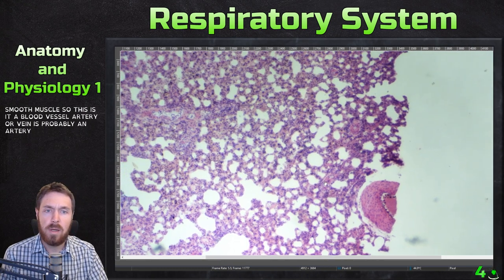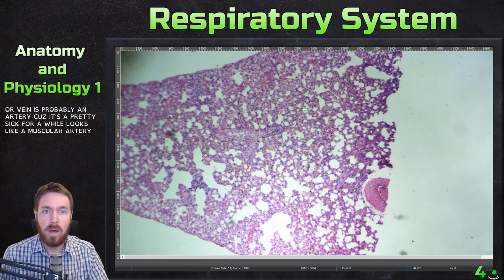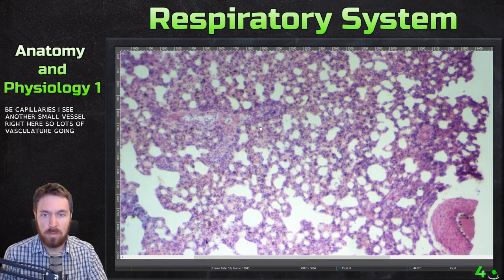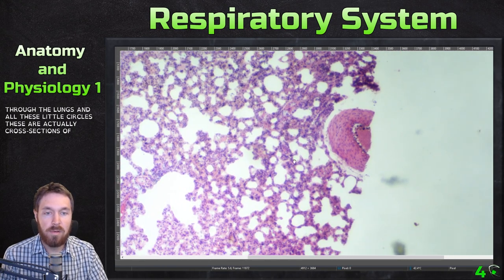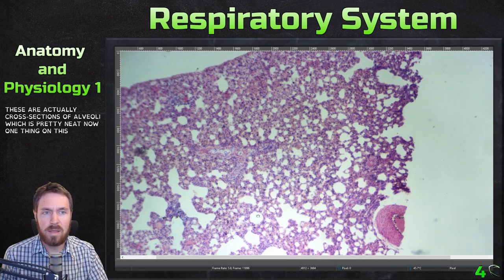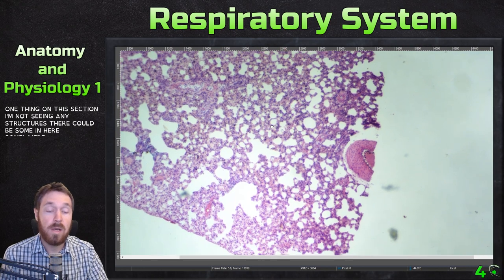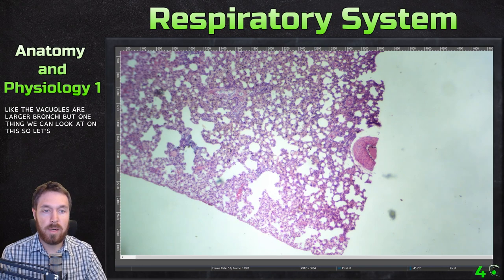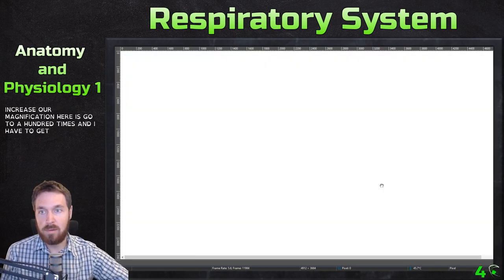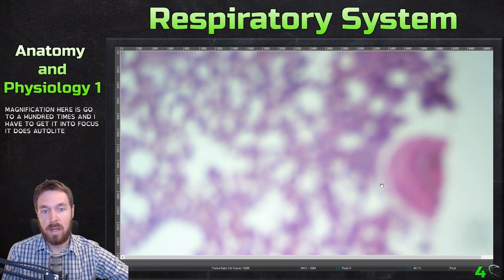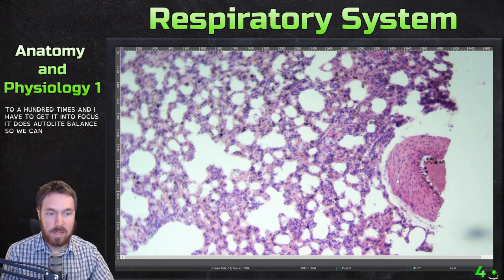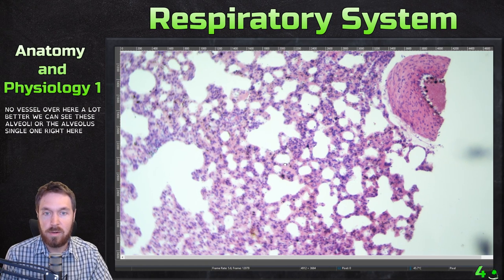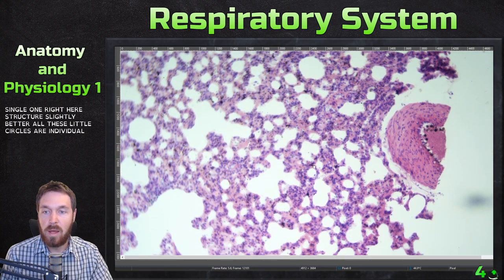Over here these little red spots are other vessels, possibly capillaries, and I see another small vessel right here — lots of vasculature going through the lungs. All these little circles are actually cross-sections of alveoli, which is pretty neat. I'm not seeing bronchioles or larger bronchi on this section, but let's increase magnification to 100x. Now we can see this vessel better and these alveoli more clearly. All these little circles are individual alveoli throughout the lungs.